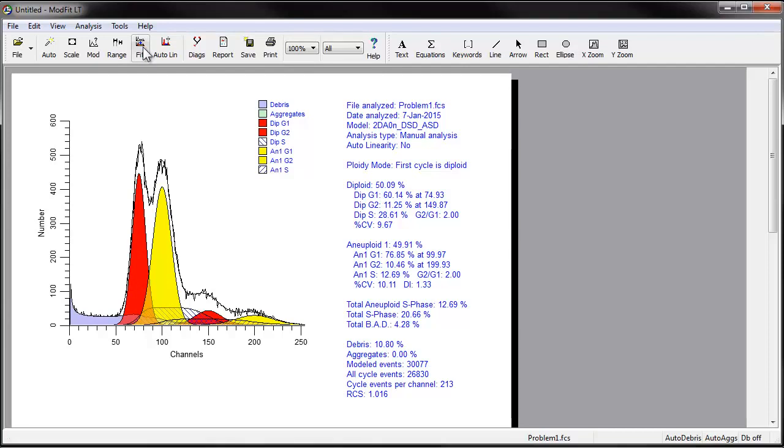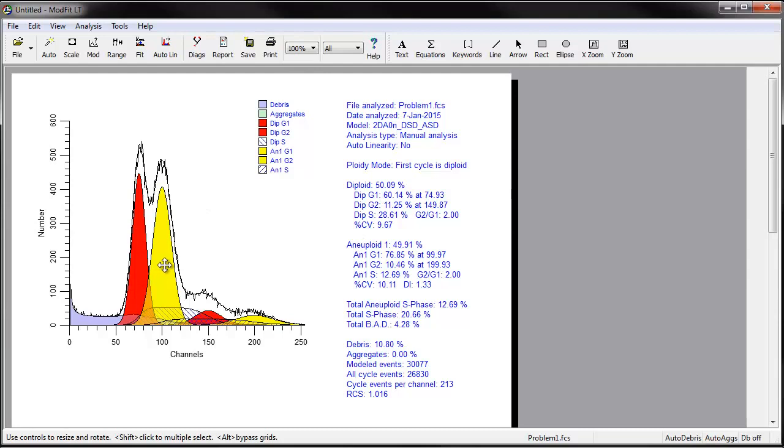Review the analysis to ensure that the model correctly matches the sample. If the RCS value is high, you should make sure you selected the correct model and that its ranges are also correctly positioned.